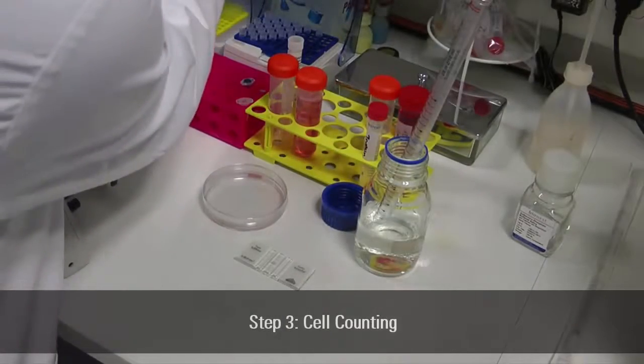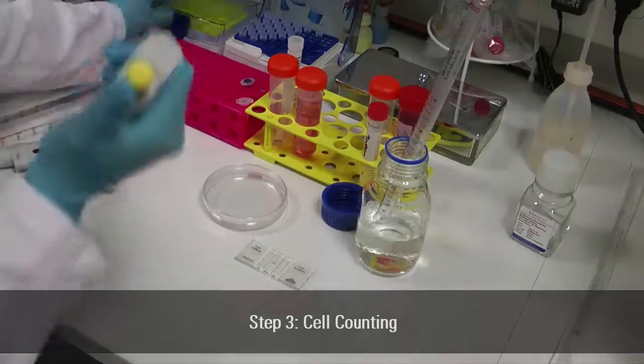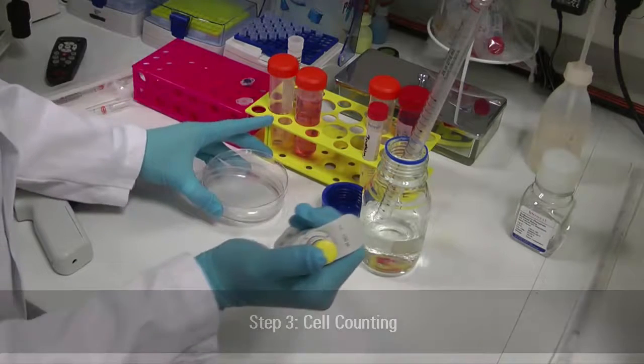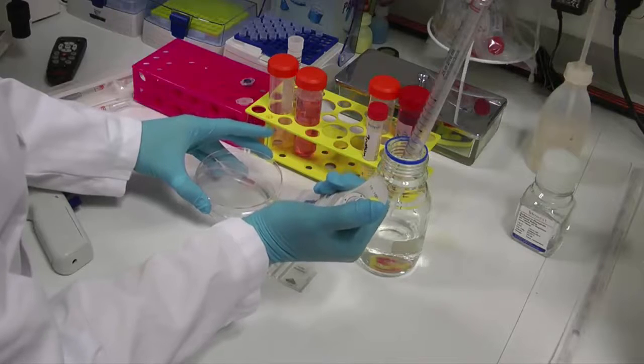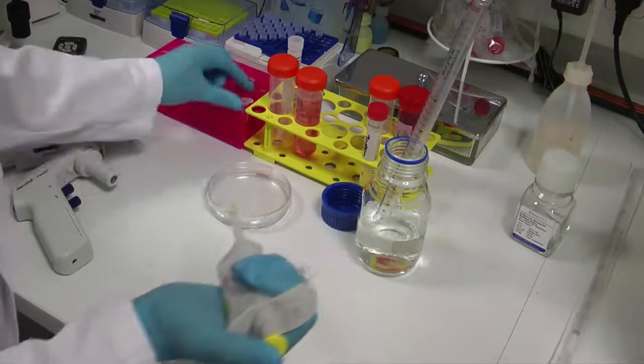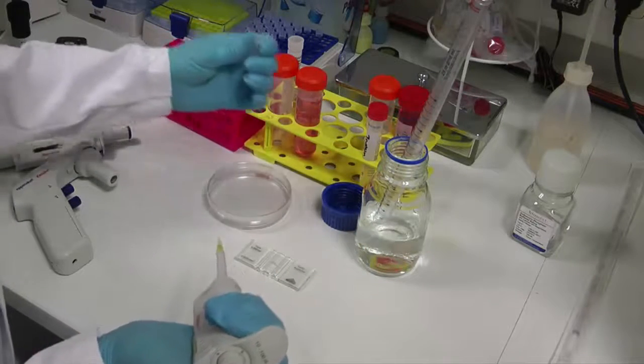Mix 100 µL cell suspension with an equal amount of 0.4% trypan blue solution. Trypan blue selectively penetrates cell membranes of dead cells and stains them blue, but is not absorbed by living cells.